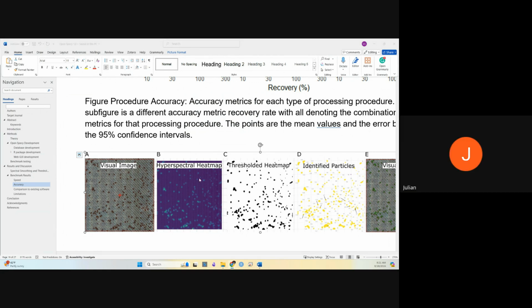Okay, can I then ask a follow-up? Typically, is this type of stitched image something that you would capture with a focal plane array? Or is it a faster technique? I mean, it's not just one snap that you can take over time. It's a focal plane array, and then another route for analysis might be to take that image and run it through something like Simple.